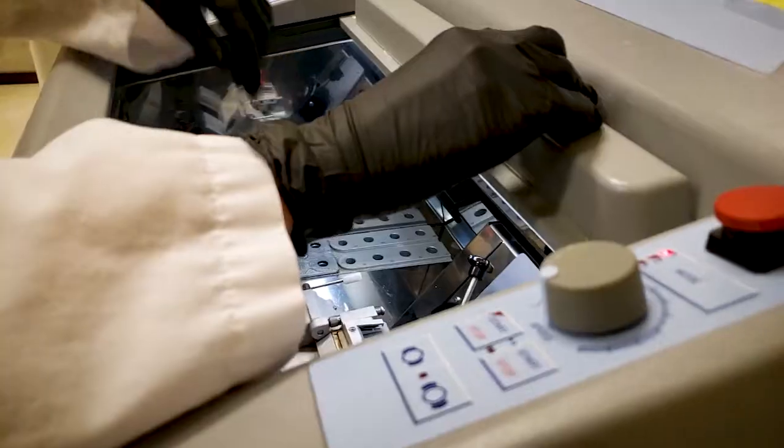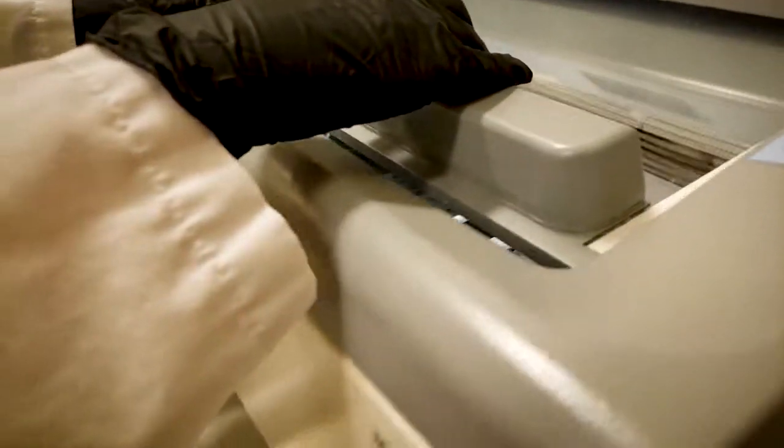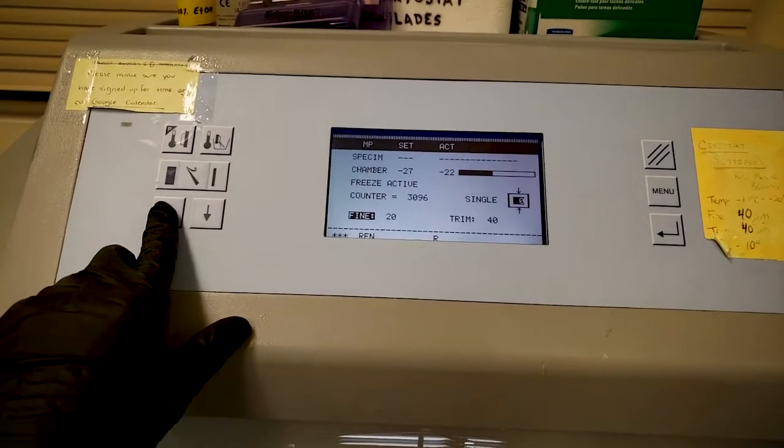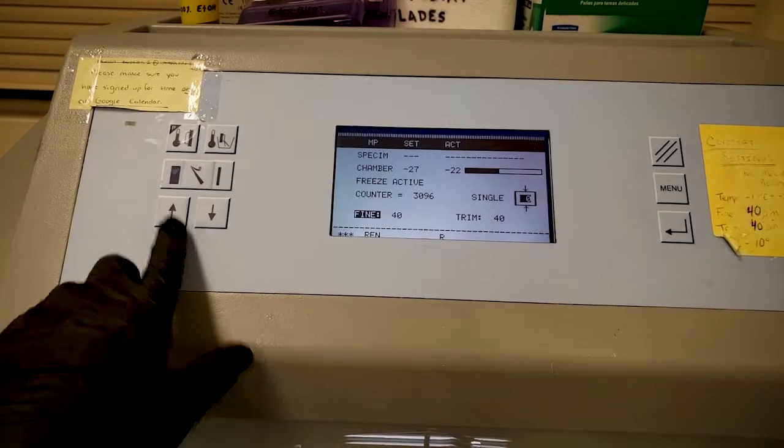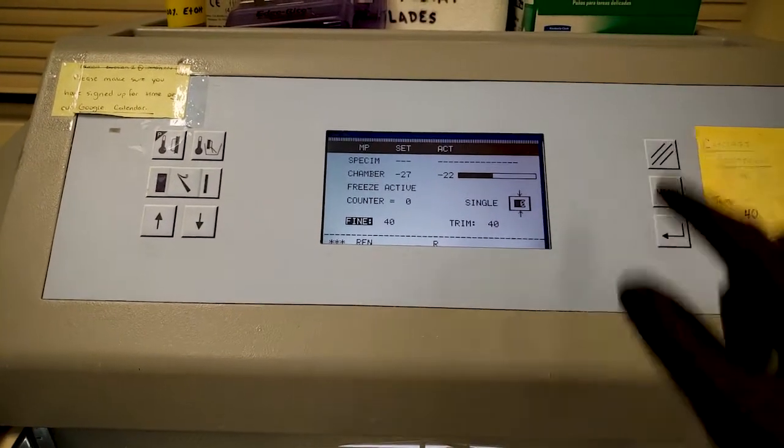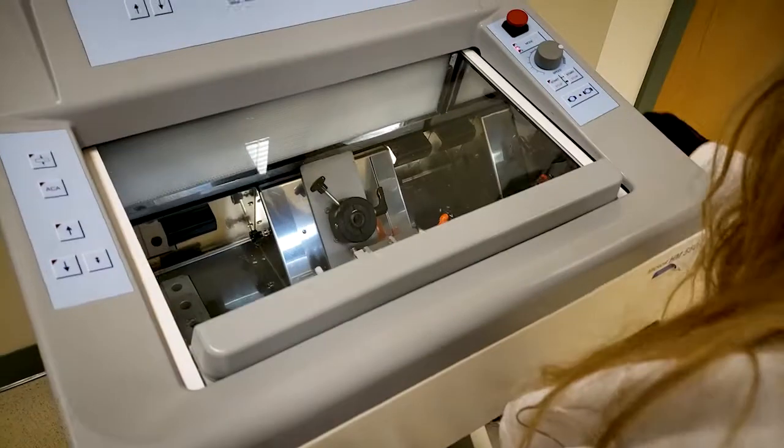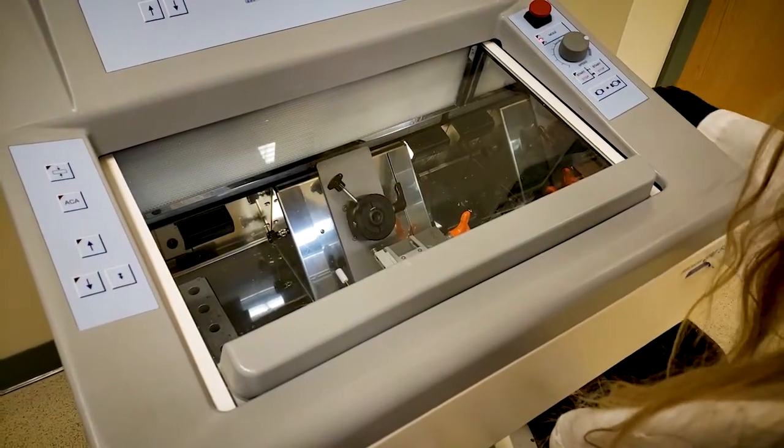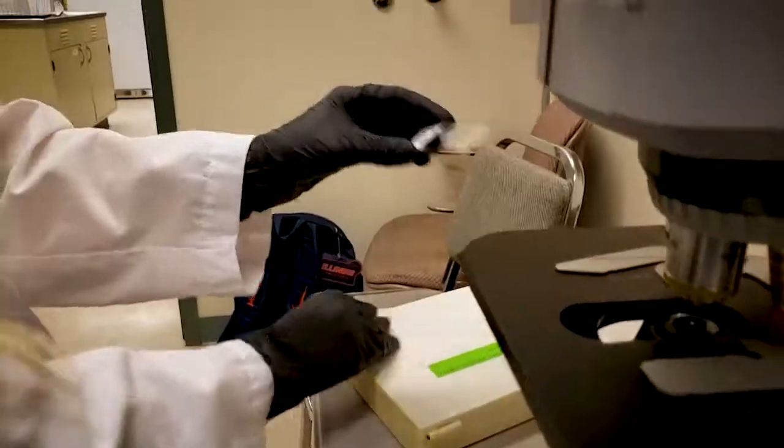A cryostat contains a chamber that can maintain very low temperatures. Laboratories use a cryostat to preserve frozen tissue samples, while a microtome, an extremely sharp cutting instrument mounted inside the cryostat, slices the tissue into pieces thin enough to be observed under a microscope.